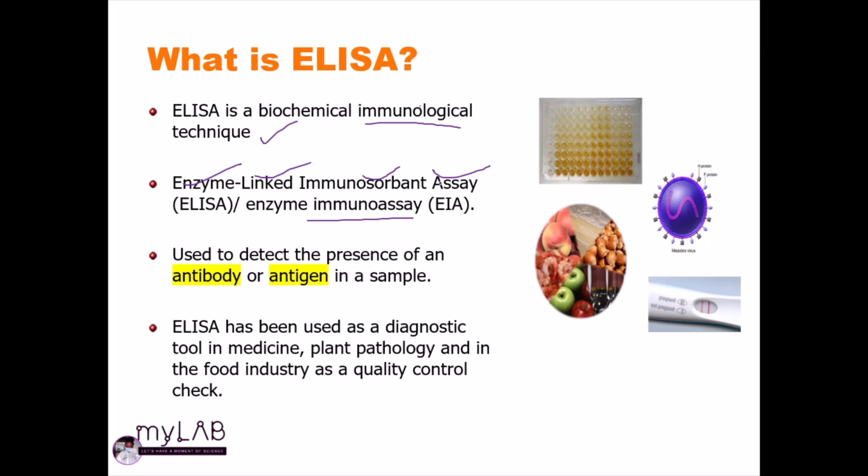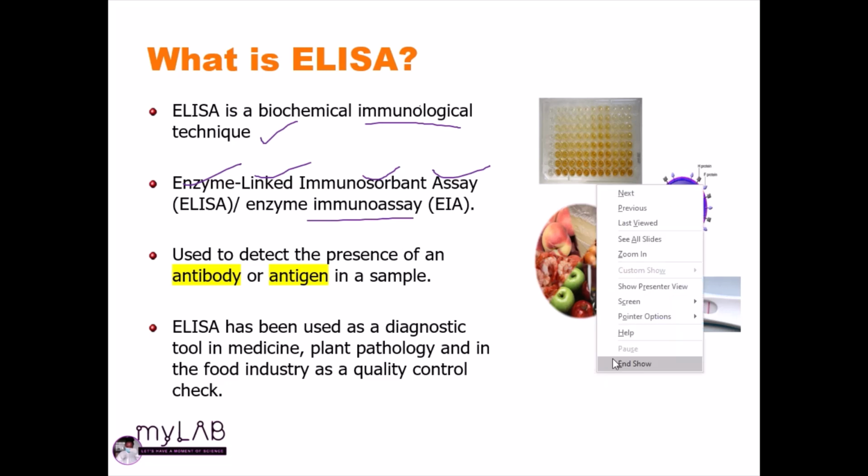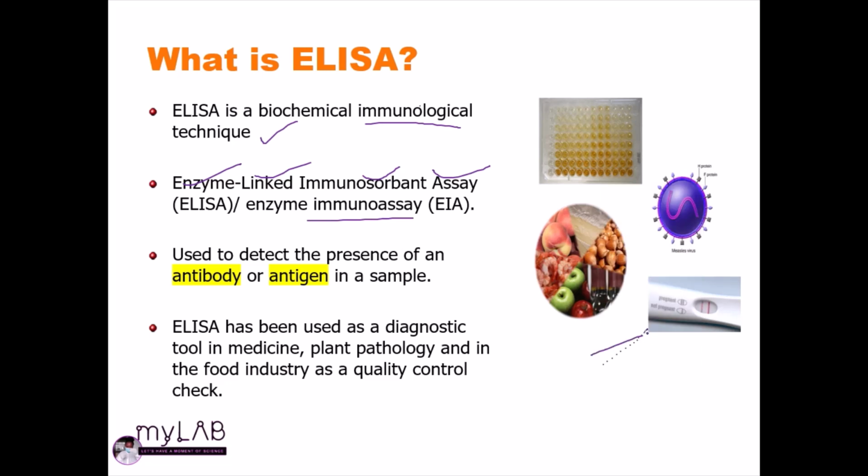So ELISA is a dynamic test that has been in existence for a long time, and we are using it a lot. Today we also have what we are calling ELISA-based assays, like a diagnostic kit like this one. It is using the enzyme-linked immunosorbent assay principle, such that we have the coating of this diagnostic kit with maybe an antigen or an antibody against a certain disease.